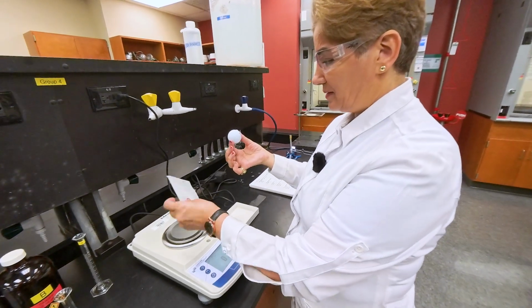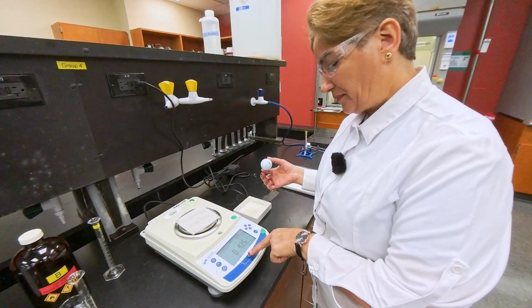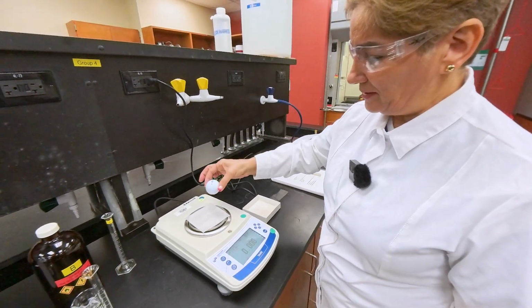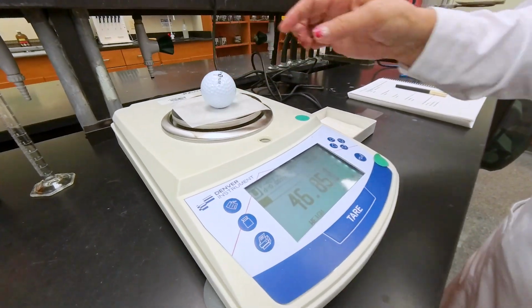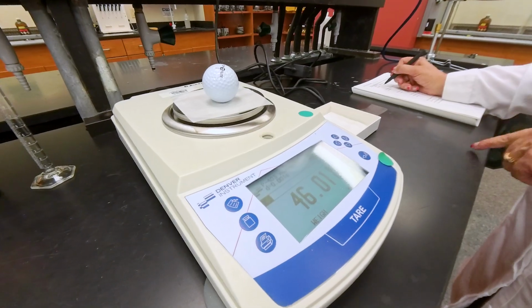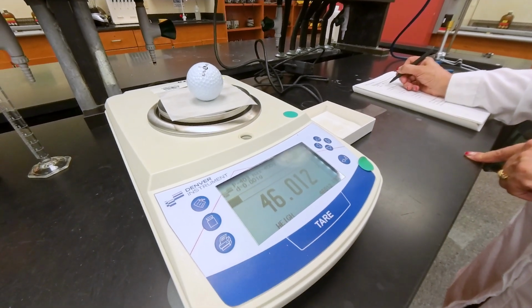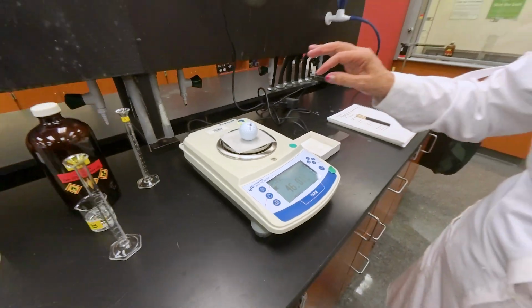For the mass, just for protection of the scale, I'm using the weighing paper again. Make sure that it's tared, because I don't need the mass of the weighing paper in this case. I place the golf ball on the scale and we record the mass. The mass for the golf ball with 3 decimal places needs to be recorded, and then we can do the calculation.